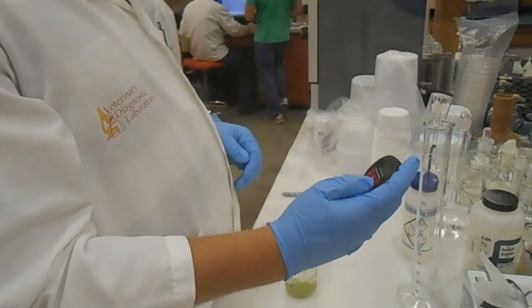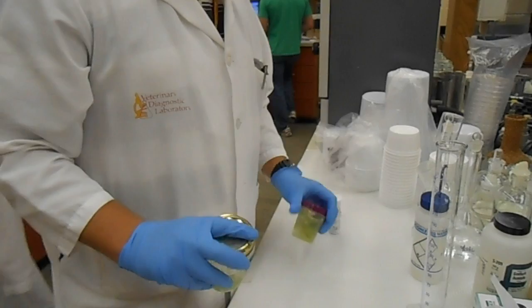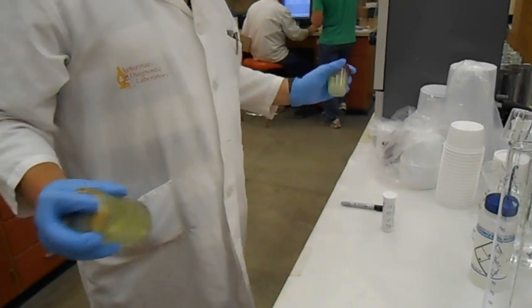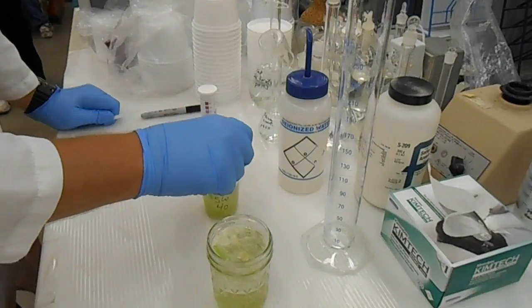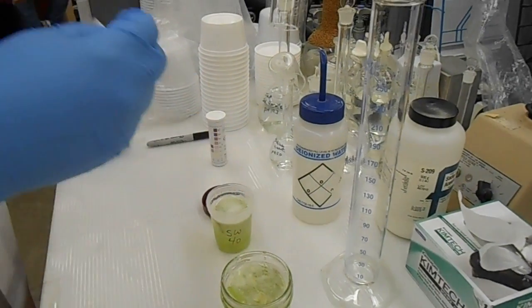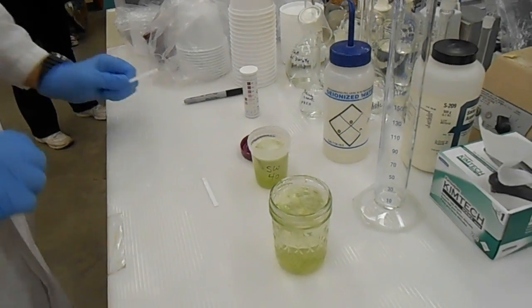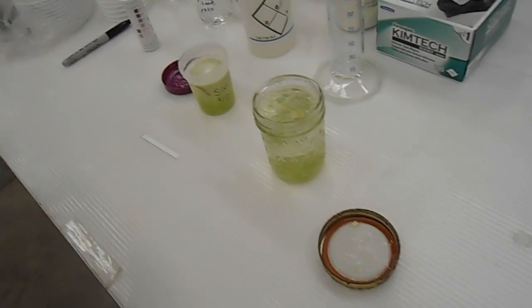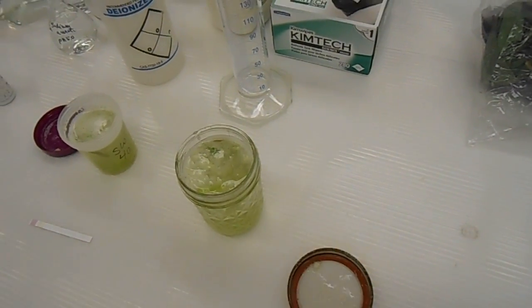After you've added the water, shake it for one minute. Next, take your test strip and put it into the extraction solution for one second. Shake the excess water off the strip, then let the strip incubate for one minute.